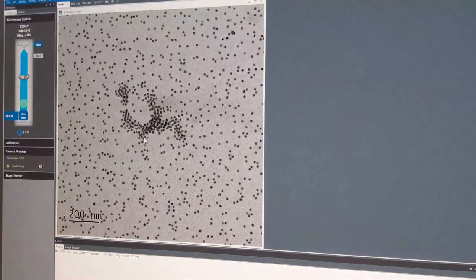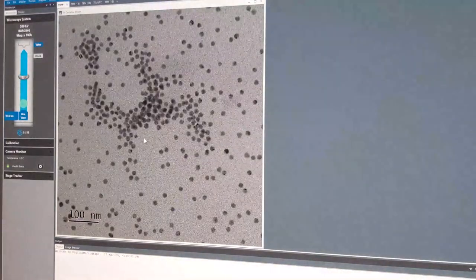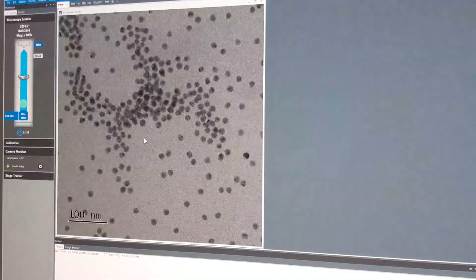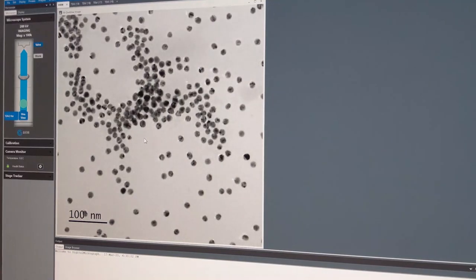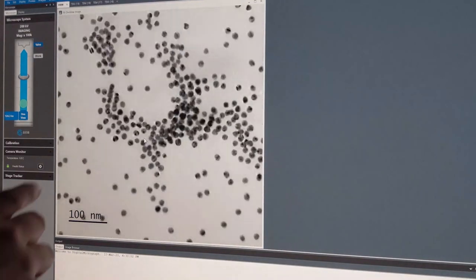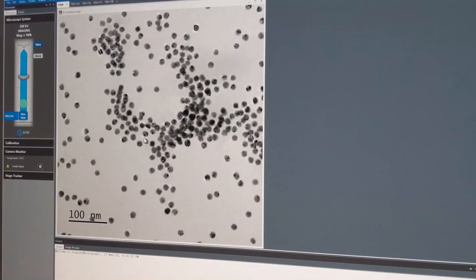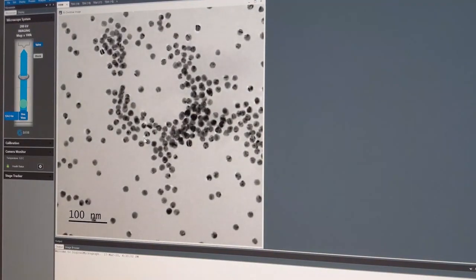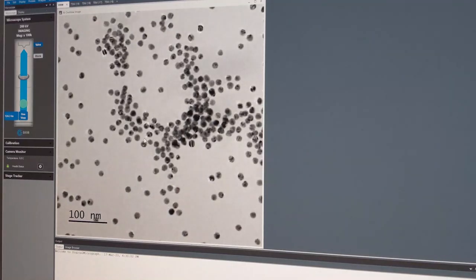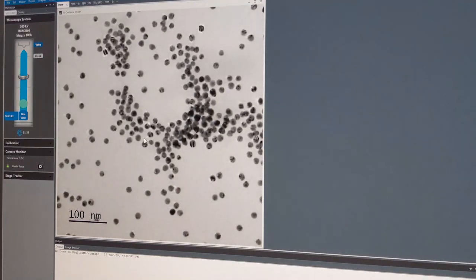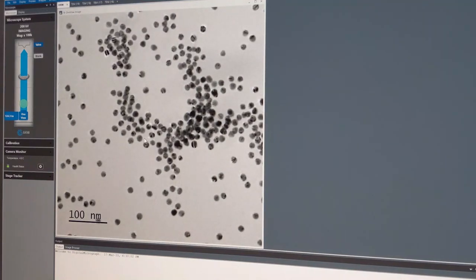If I magnify further to about 100,000 times and increase the brightness, for example here we have a string of nanoparticles that are all touching each other and slightly overlapping. What this means is we can't accurately see the edges, which we need to be able to do to measure their size. So we don't use regions like this for size determination.